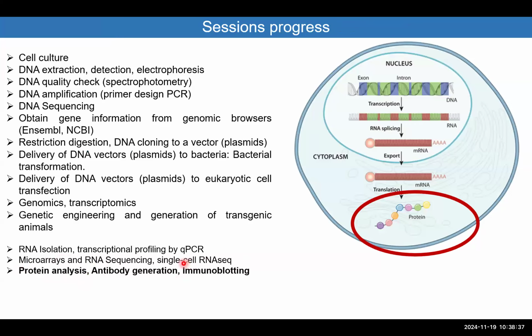And we will start delving into the applications. We will start with the application that doesn't need proteins to be sorted based on their molecular weight. We will just look at proteins that are floating in serum or blood or fluids.